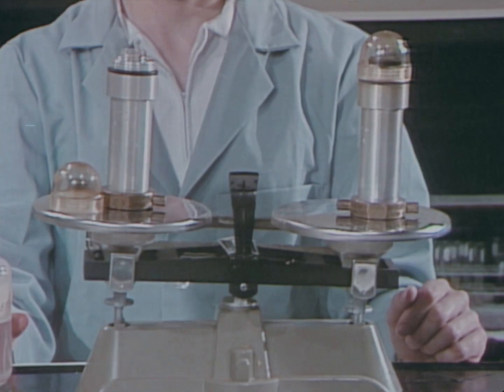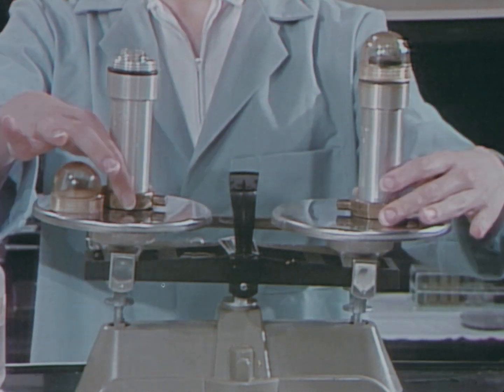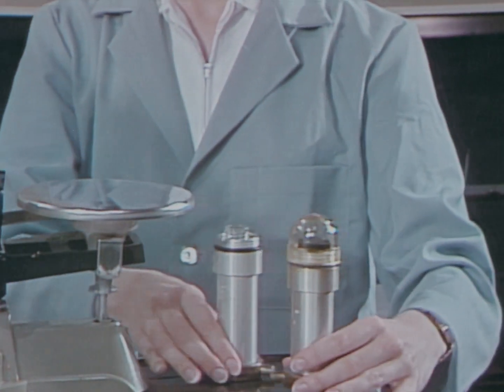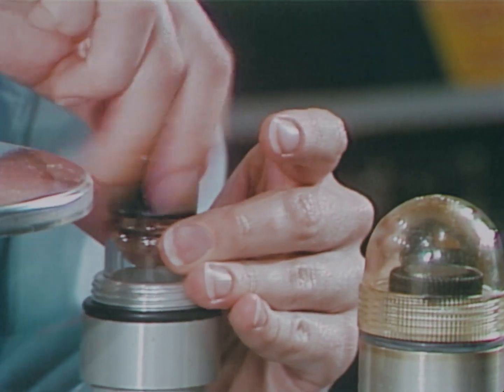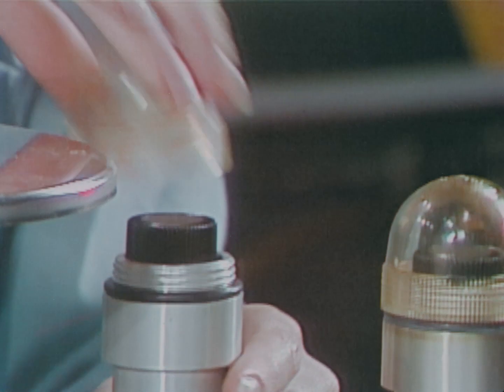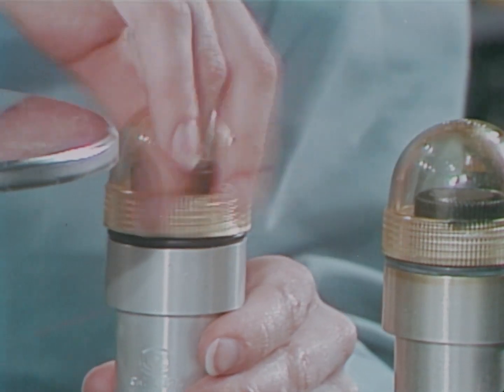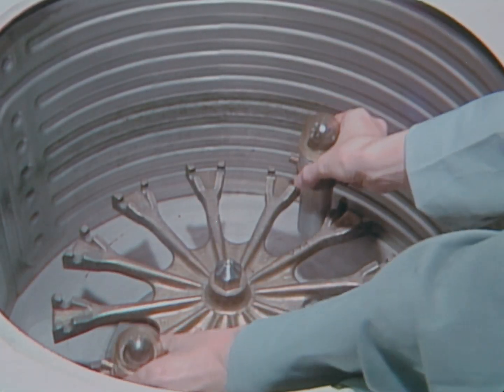Then, balance specimens on opposite sides of the centrifuge head. Balancing will reduce vibration and stress, thus minimizing the possibility of breakage. Cap and seal each safety carrier carefully. Finally, replace the centrifuge cover and make sure that it is secure.